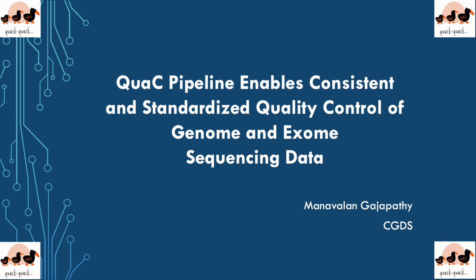Hi, let's talk about how we use the QuaC pipeline at our center to help with consistent and standardized QC on genome and exome sequencing data.